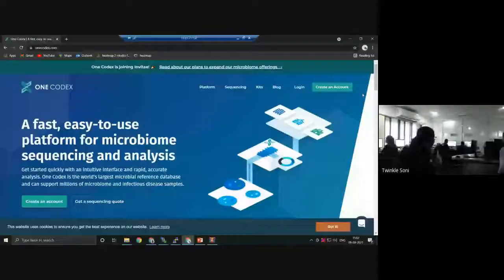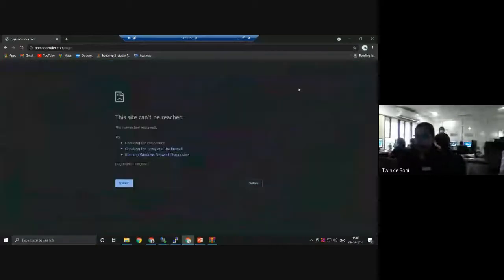You can create an account over here, but as I already have a OneCodex account, I will log into it. You can easily create a free account in it.